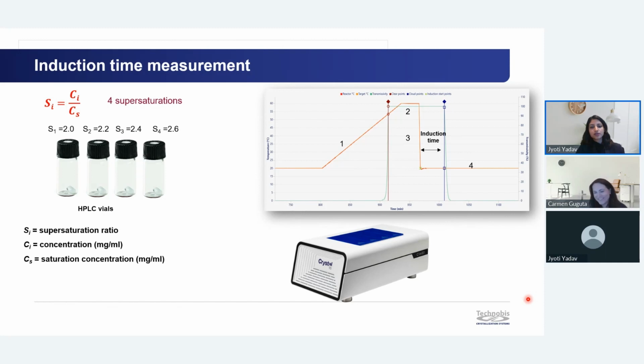Yeah. It controls because nucleation is like a stochastic process. If you perform it a number of times, it controls the stochastic behavior and it averages out the induction time. So at least 80 times, you can do more, but 80 times is like the required number of repetitions you need to do at one supersaturation. To have reliable data. Yes.